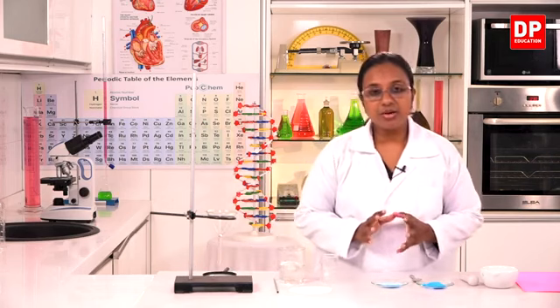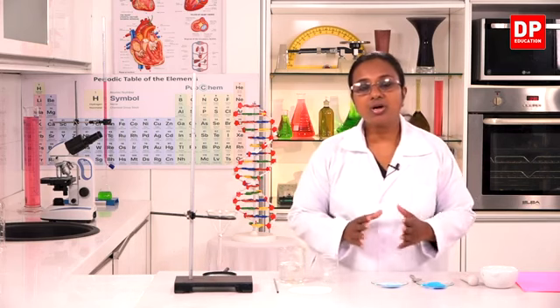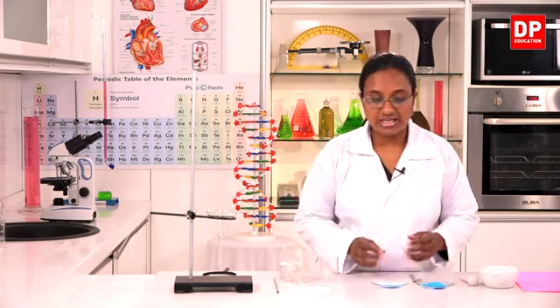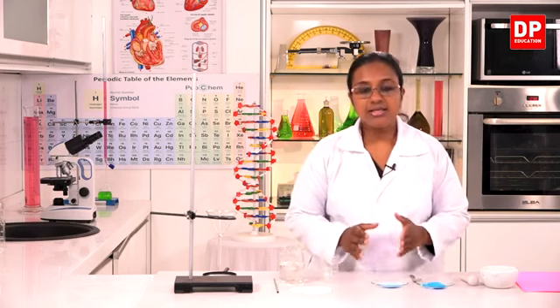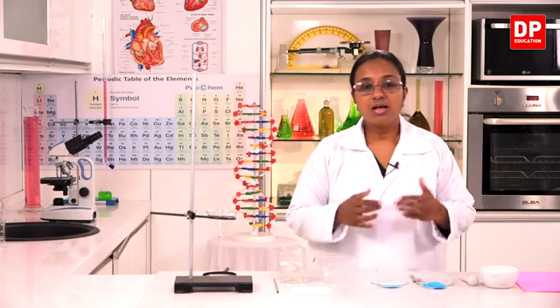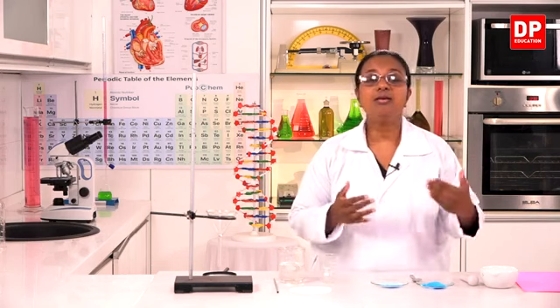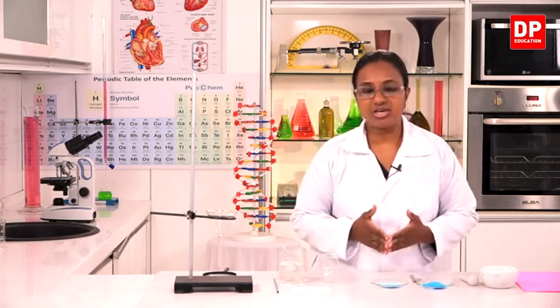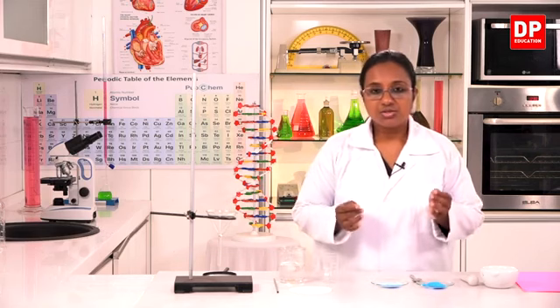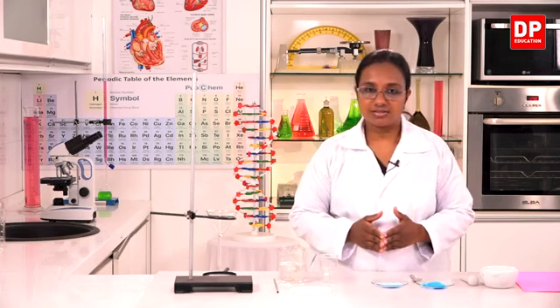Here again, you can see both the colors, but you can't really differentiate and separate them out. So this is a mixture. Mixture is a substance where more than one pure substances are mixed together and they exist together as one. So this is where you understand what mixture is.